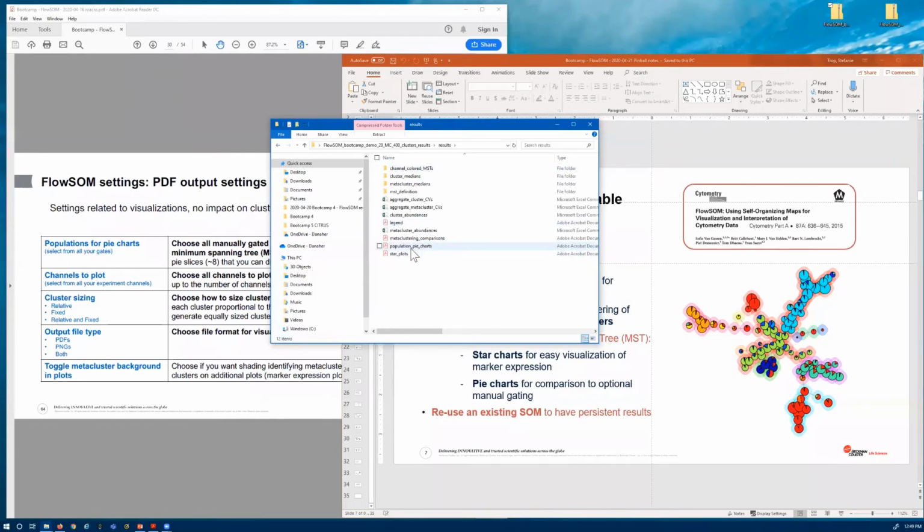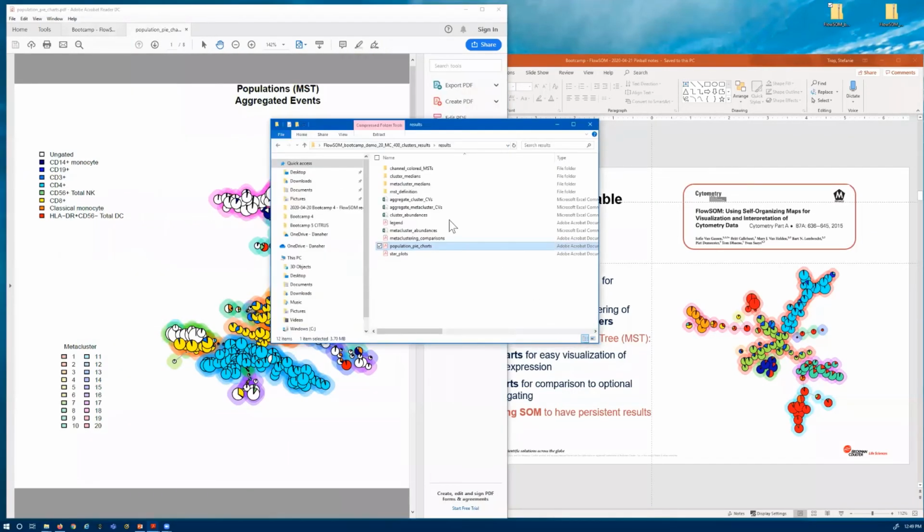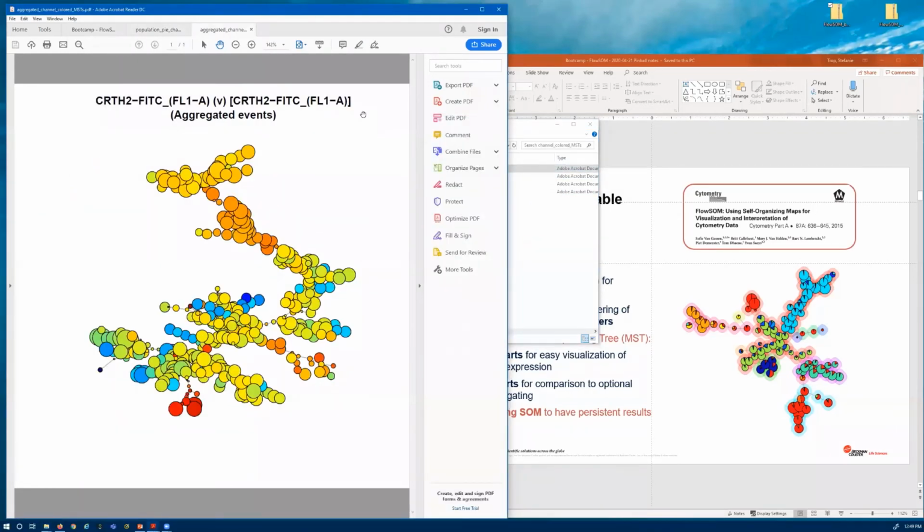Perfect, thank you. Okay, our next question is a pretty simple one. If you're running a tSNE and then a FlowSOM, will you run FlowSOM on raw data or on the tSNE data? Will you include the tSNE 1 and 2 into your FlowSOM run? And I'm just gonna get Chinjin to answer this.